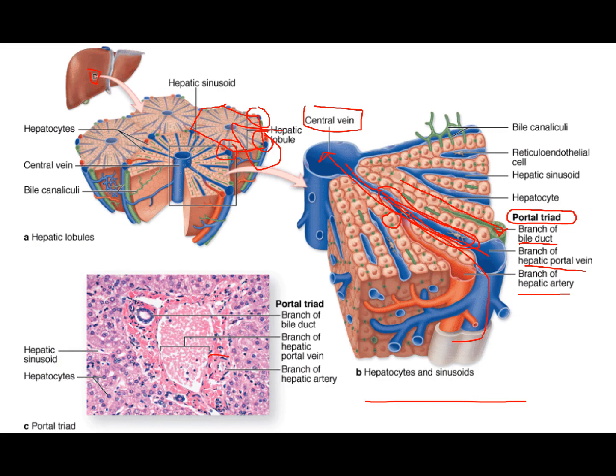And then on the left here is an actual picture of what the liver looks like. So we have a portal triad. We have our little hepatic artery right here. We have our larger in diameter portal vein coming in. You can see all the erythrocytes in that portal vein.